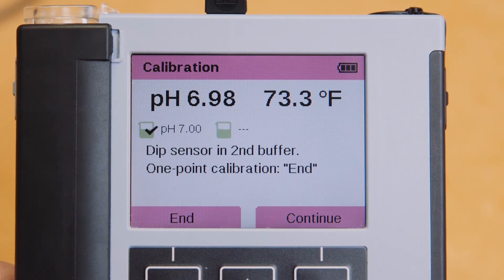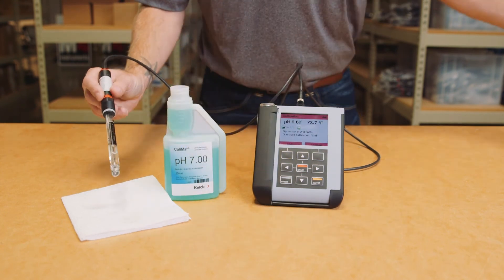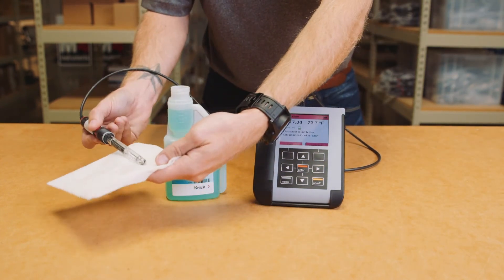Once finished with the first buffer solution, the Portavo prompts you to dip the sensor in the second buffer. You will now want to rinse the sensor with a cleaning solution such as distilled water prior to putting it in the second buffer solution. Then dab it dry, being very careful not to rub the glass bulb.